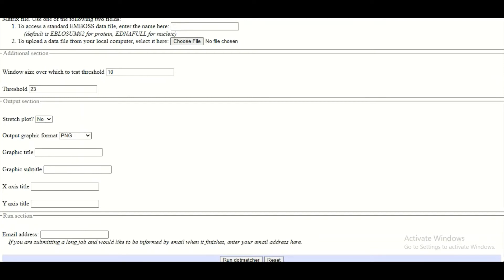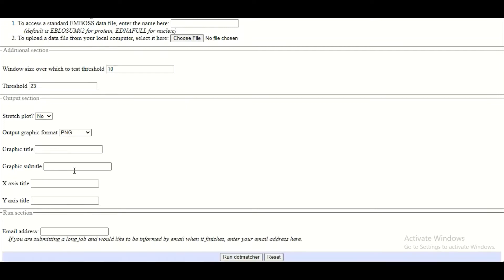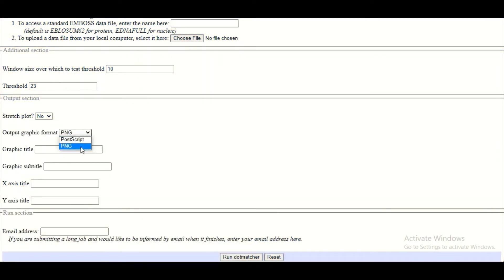Some of the information is mandatory while some of the information is optional. For example, the stretch plot — whether you want a stretch plot or non-stretch plot is up to you. What type of output you want to have — a PostScript type of output or a picture output in the form of PNG. What type of title you want — let's assume we want to give a title to our dot matcher plot as 'first plot'.